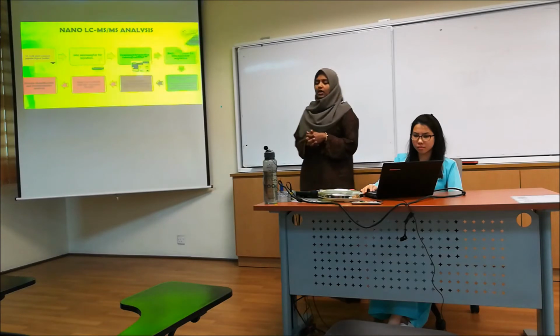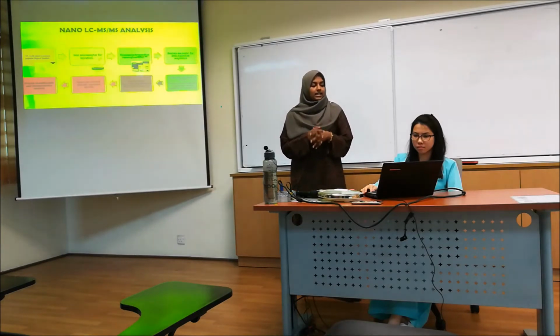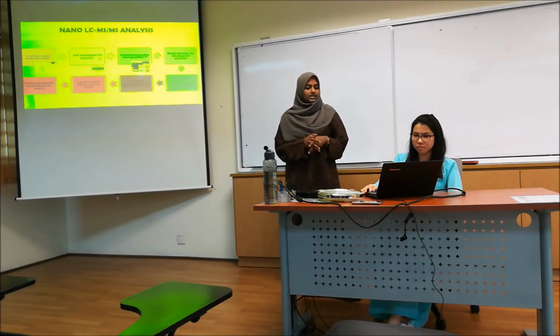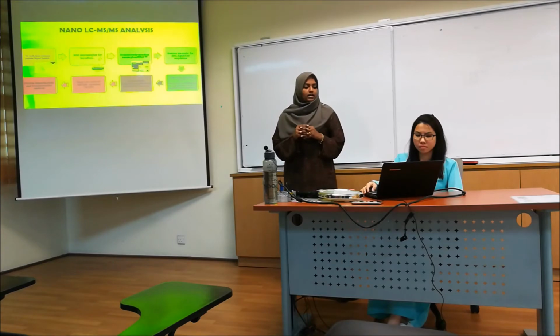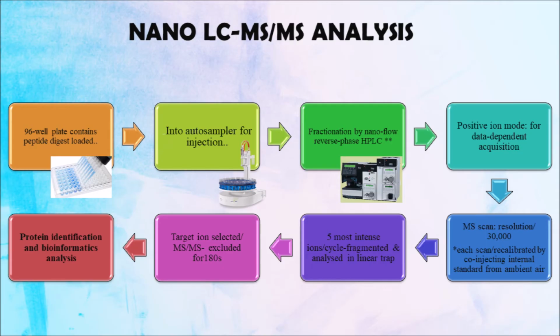Okay, now I'll explain in detail how the nano LC-MS-MS analysis has been carried out. The 96-well plate is inserted with digested peptide, and then it is loaded into the autosampler for injection, and then fractionation by nano flow reverse phase HPLC. If you can see, the nano flow reverse phase HPLC looks like that.